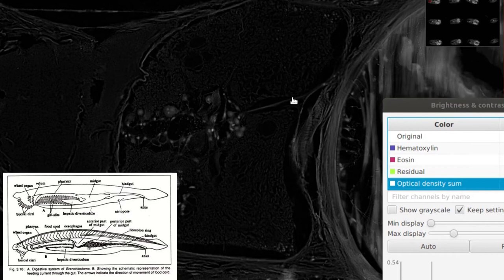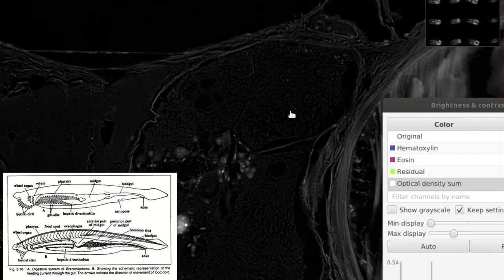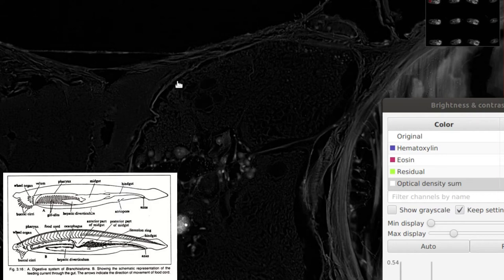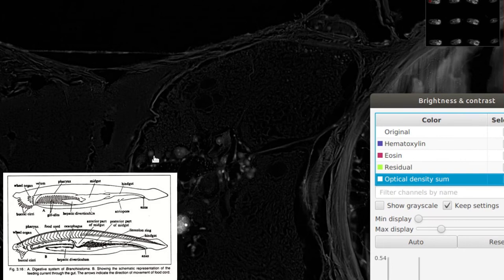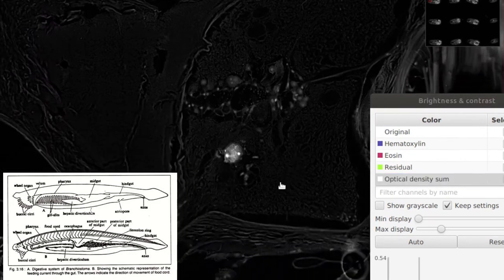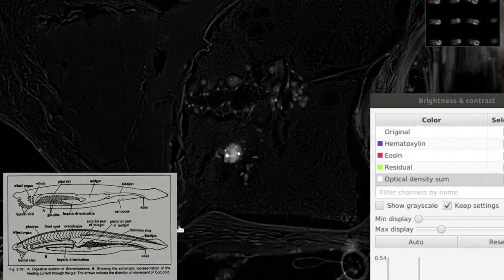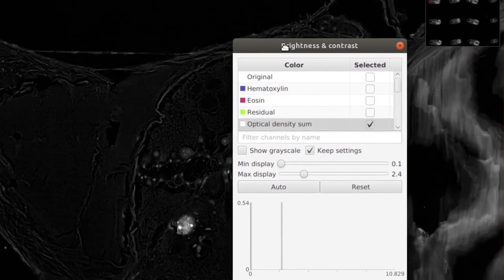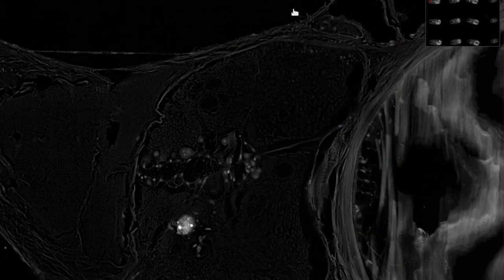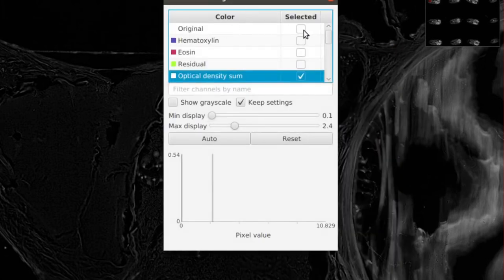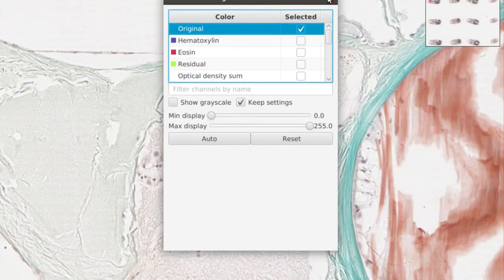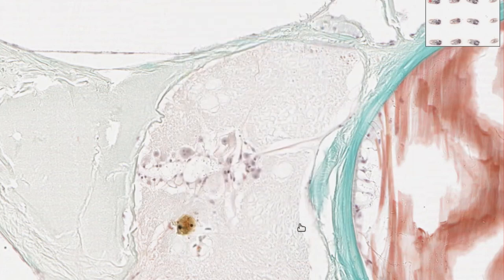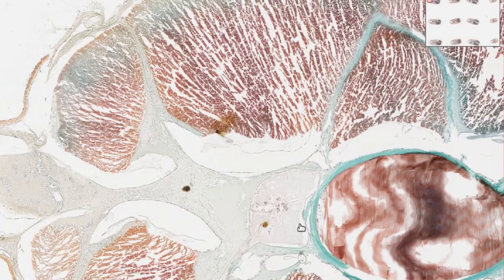Perhaps that's a little better. This structure here is the dorsal nerve cord. And we can see some neurons here that are signaling that. And then this looks to be like a nerve coming off from it. But we can discuss that and the nervous system of the branchiostomes perhaps in a later video.